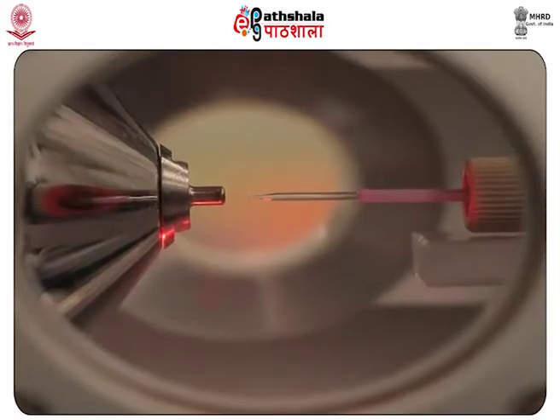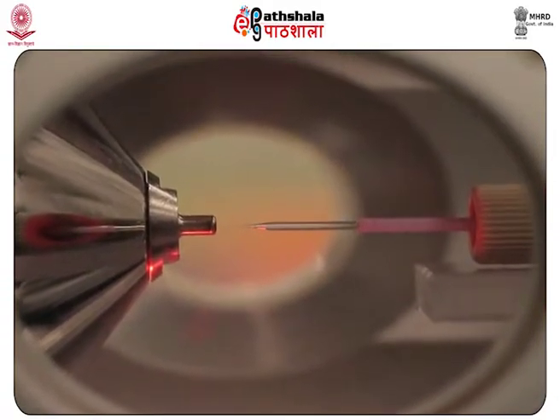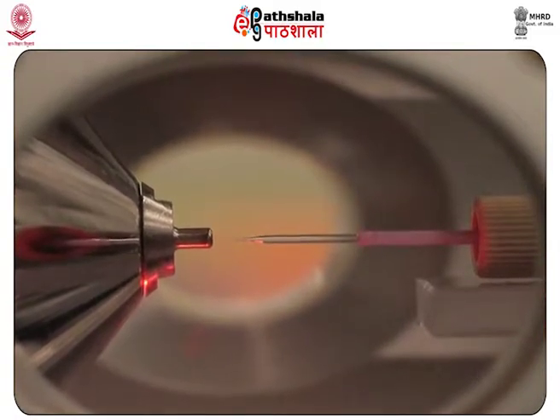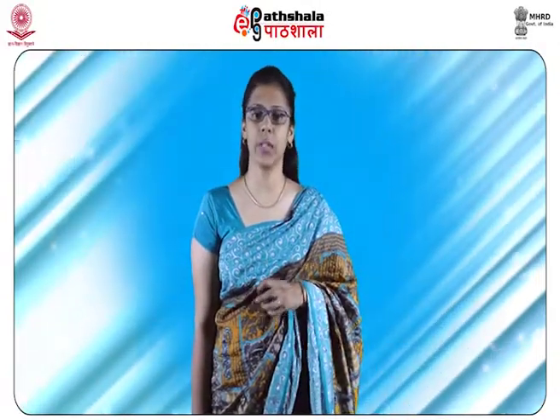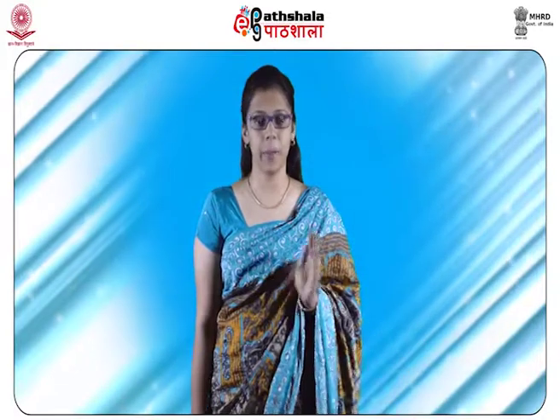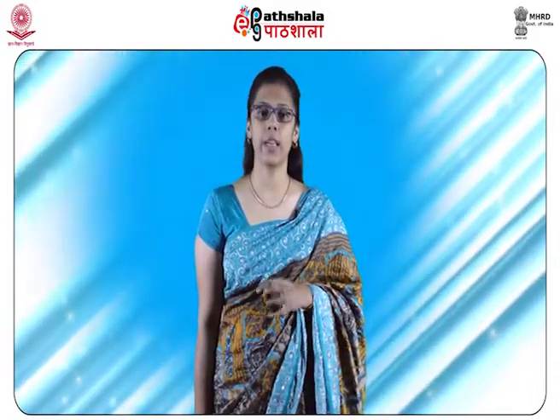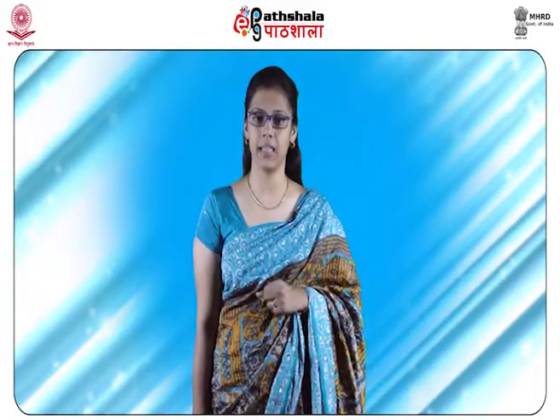Capillary electrophoresis is a family of electrokinetic separation methods performed in sub-millimeter capillaries and in micro and nanofluidic channels. Very often, capillary electrophoresis refers to capillary zone electrophoresis, that is CZE. But other electrophoretic techniques, including capillary gel electrophoresis, that is CGE, capillary isoelectric focusing, that is CIEF, capillary isotachophoresis, and micellar electrokinetic chromatography, that is MEKC, also belong to this class of methods.